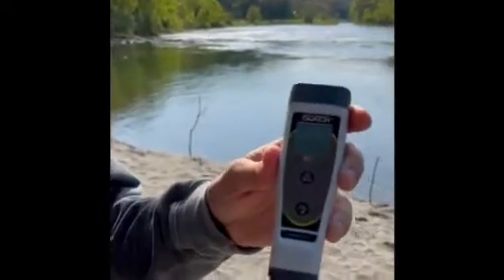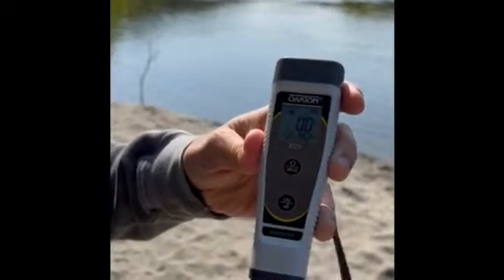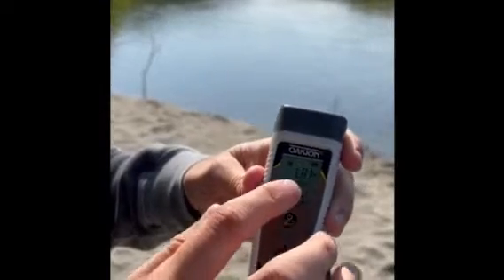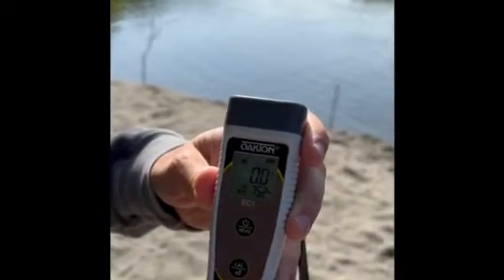To turn on the pen, it's a one click. You're going to press this button right here once, just a one tap, and the pen will be on. It's ready to use when you can see this reading here — the conductivity reads 0.0, and underneath it you'll see a temperature reading.